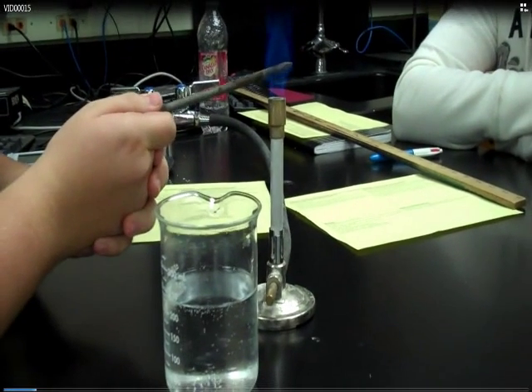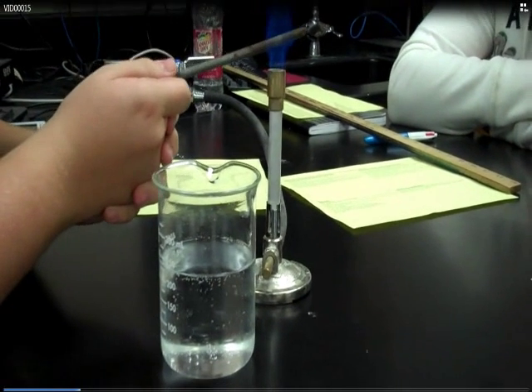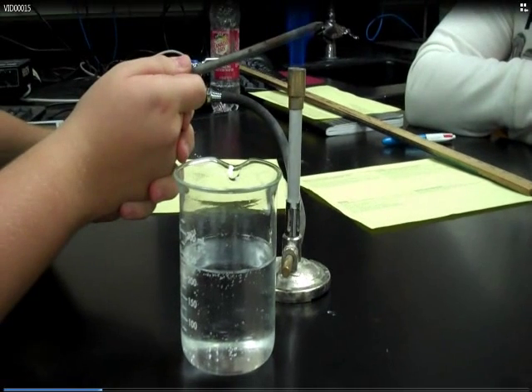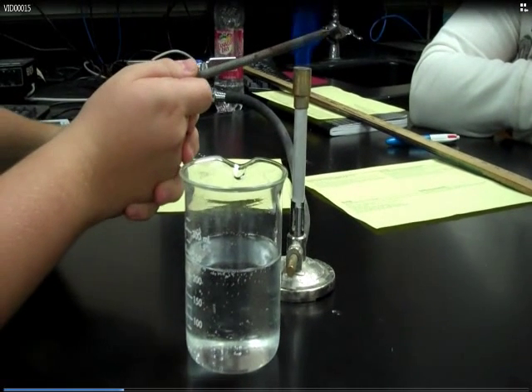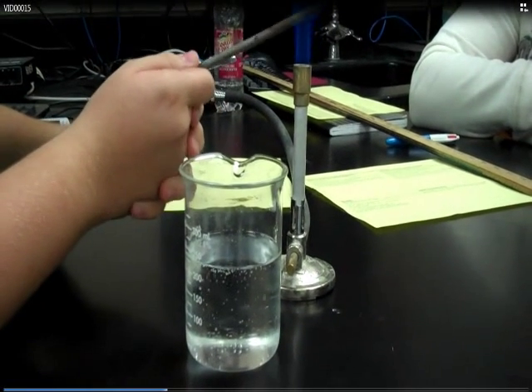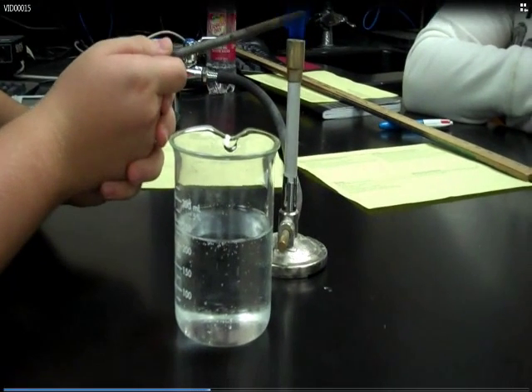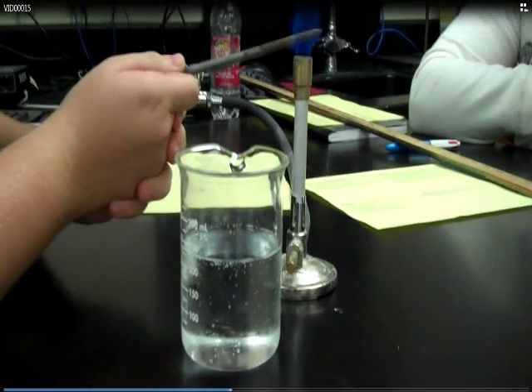Now Mason is going to demonstrate, again, the influence of temperature on the solubility of a gaseous solute. In the beaker is the carbon dioxide water solution, seltzer water. Mason is heating a nail in the Bunsen burner flame. We're going to take the nail and insert it into the solution and watch what happens right at the surface of the nail.